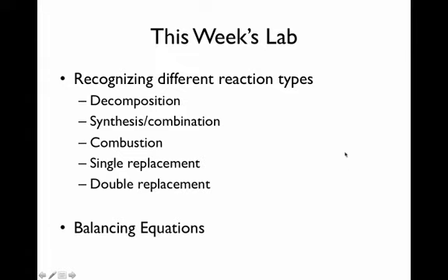And so that's one portion of this week's lab: you will do a whole bunch of chemical reactions. Actually not a whole bunch, maybe 5, somewhere around that many, and they're going to fall into different categories. There will be decomposition reactions, synthesis reactions, combustion, single and double replacement. The other thing that you'll do is you'll be given the equations, but you'll be asked to balance them. So not only will you do a bunch of chemical reactions, but you'll have to balance them.